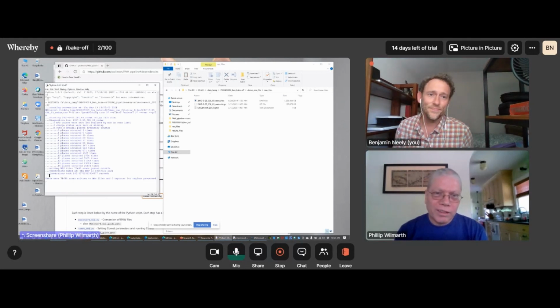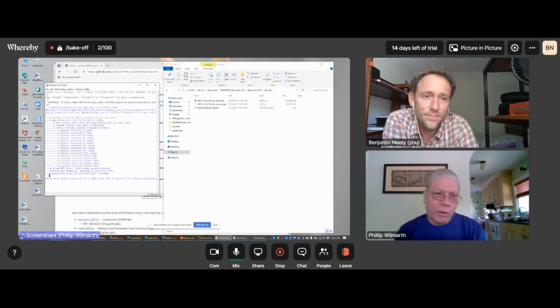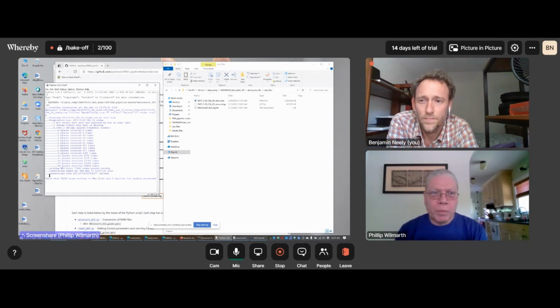Right, and it's a real pipeline. So they're separate steps. Some of these things could be wrapped together if you always did the same kind of analysis, but there are some variations on data analysis you can do by having it be modular like this. So it's a little bit more flexible this way, but for some of the real basic applications, it seems like there are some extra windows you have to click on that maybe one button could have done it all. But like you say, there's nothing magic there.